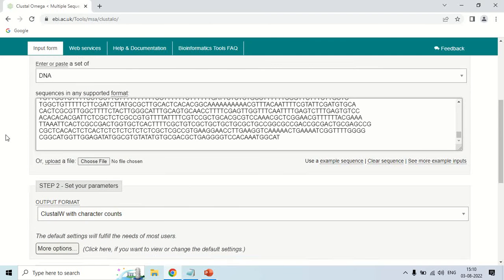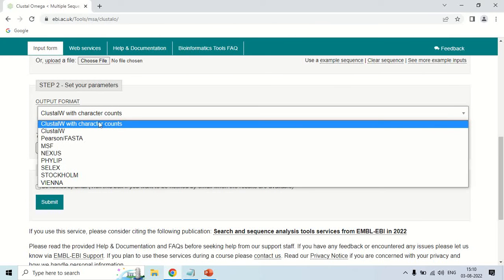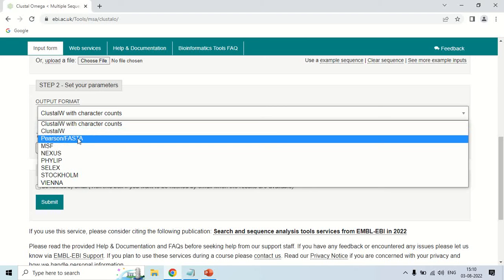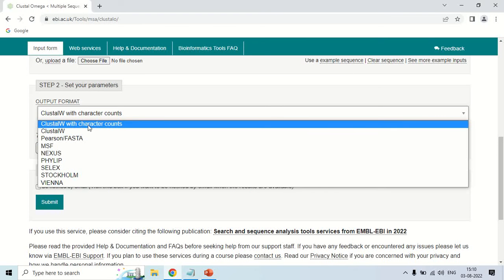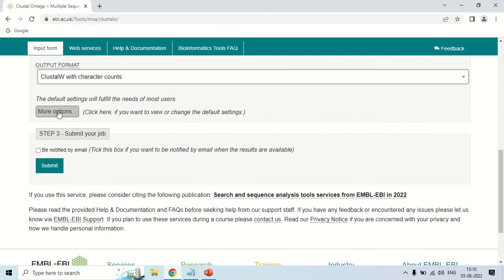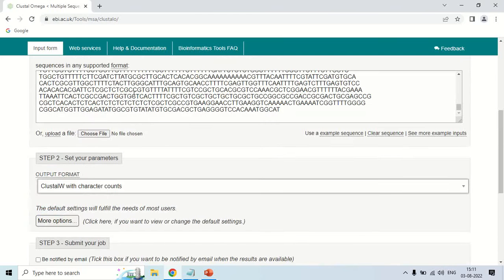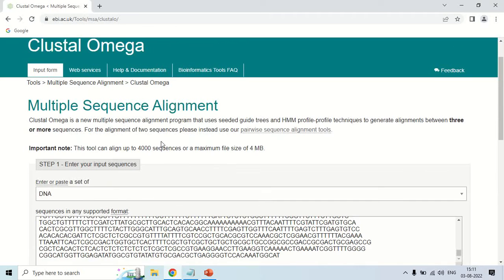The next option is to choose the output format. If you click here, there are many options like ClustalW, Pearson, and FASTA — you can choose either of them according to your need. I am choosing the first one, which is ClustalW with character counts. There are some other options under the 'More Options' button, but these default options above are sufficient for most users. I am going to proceed with the default options.